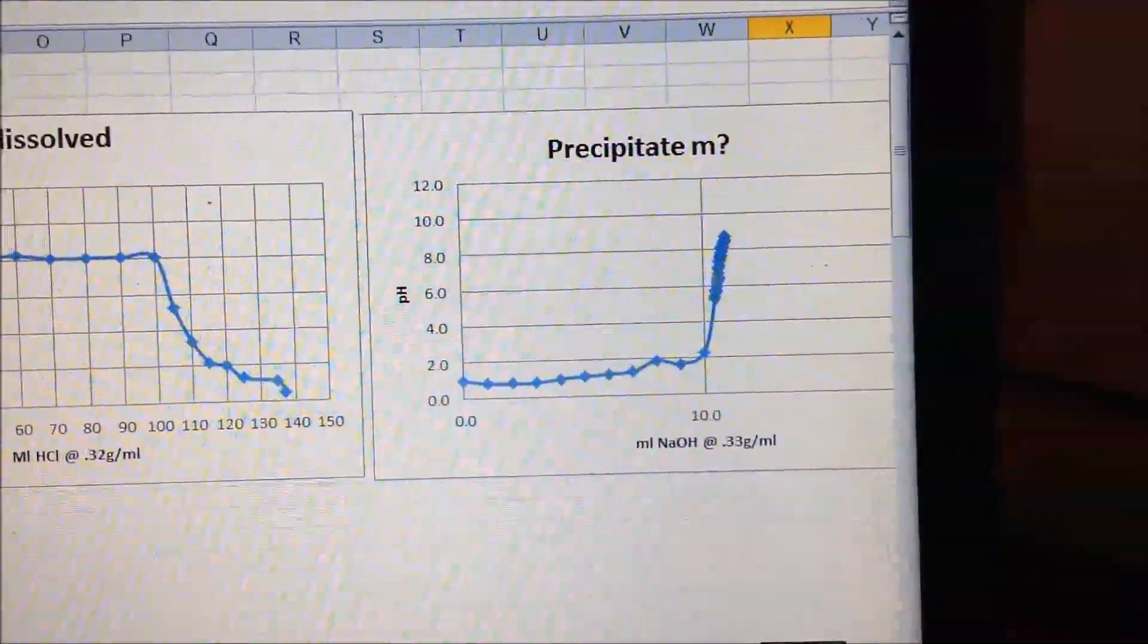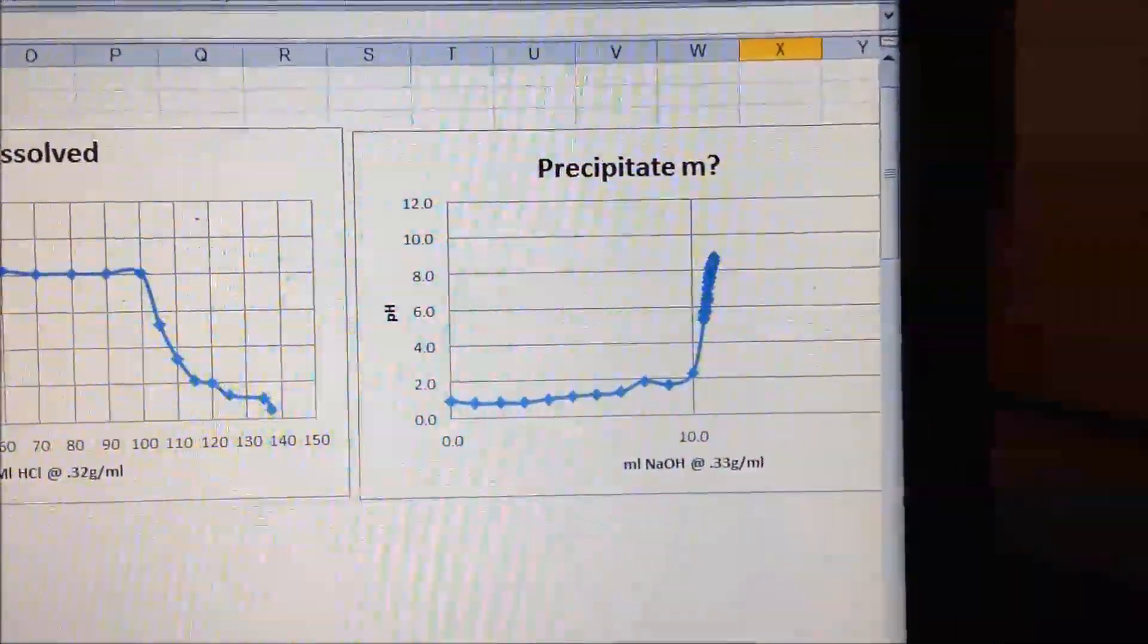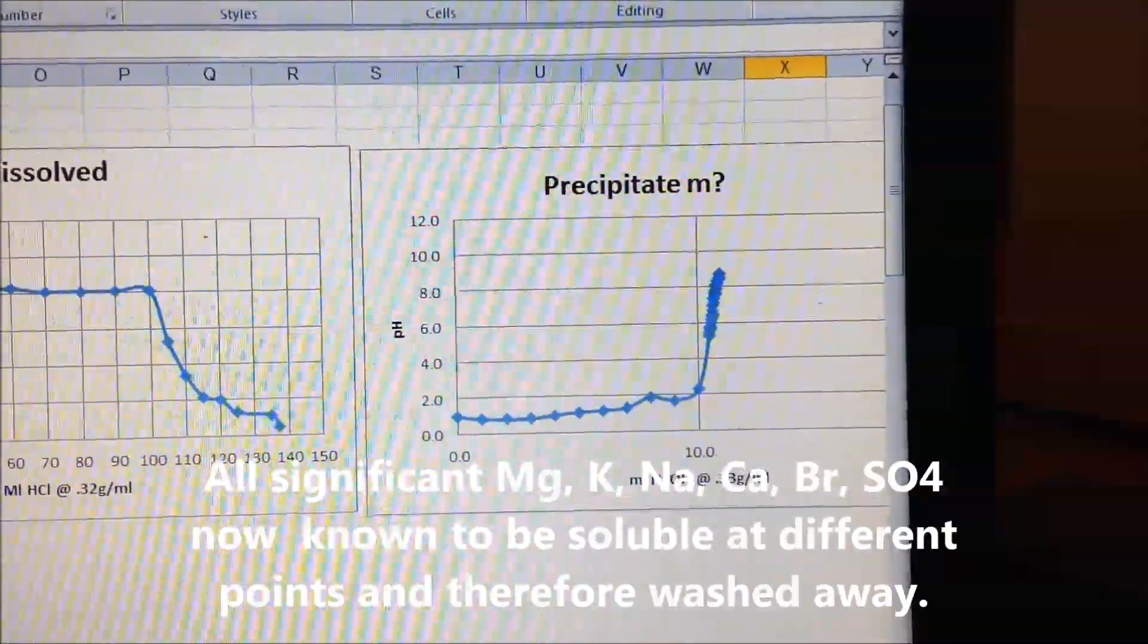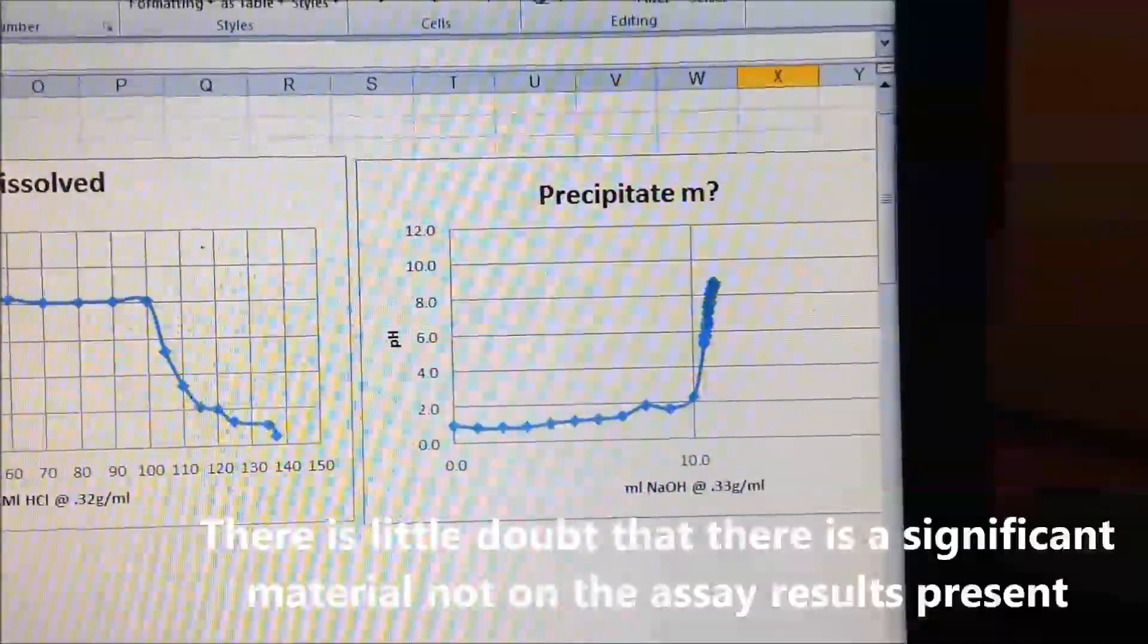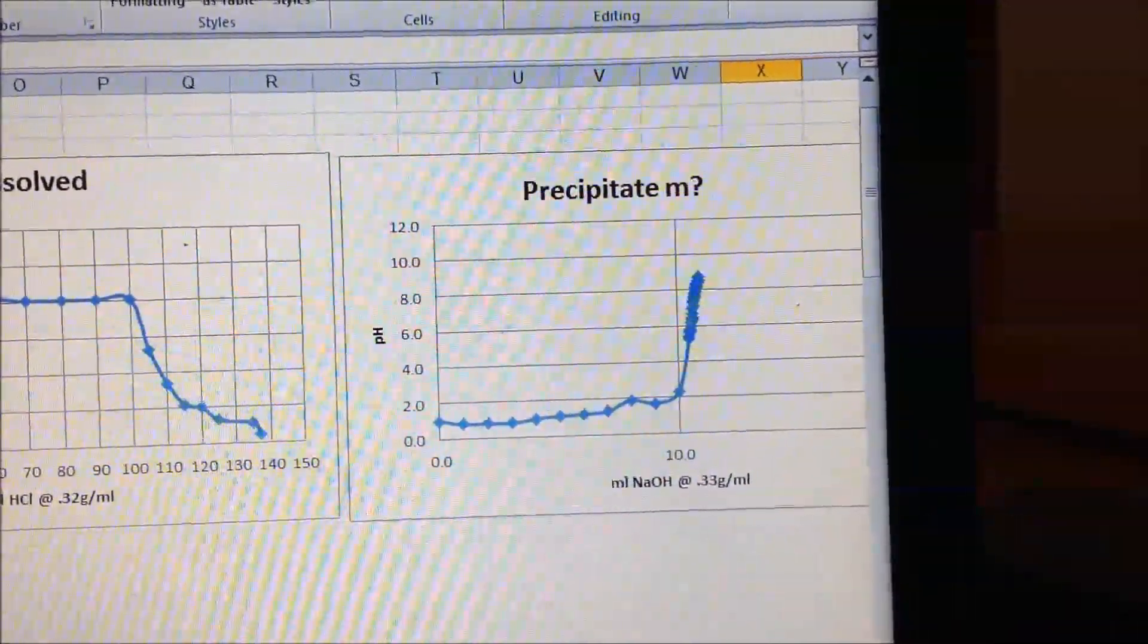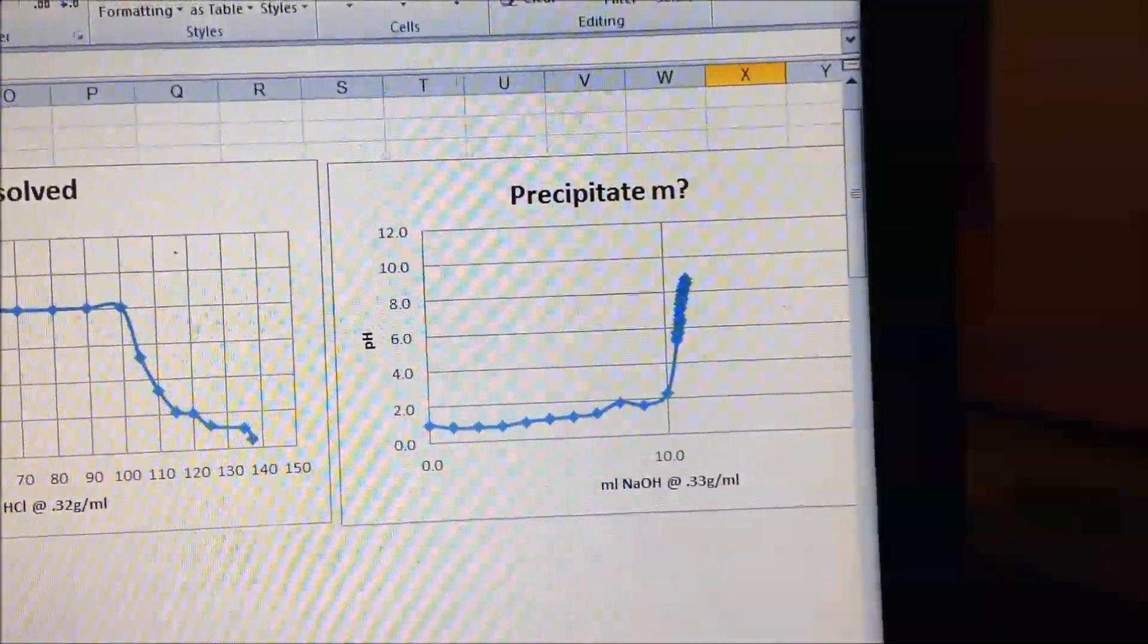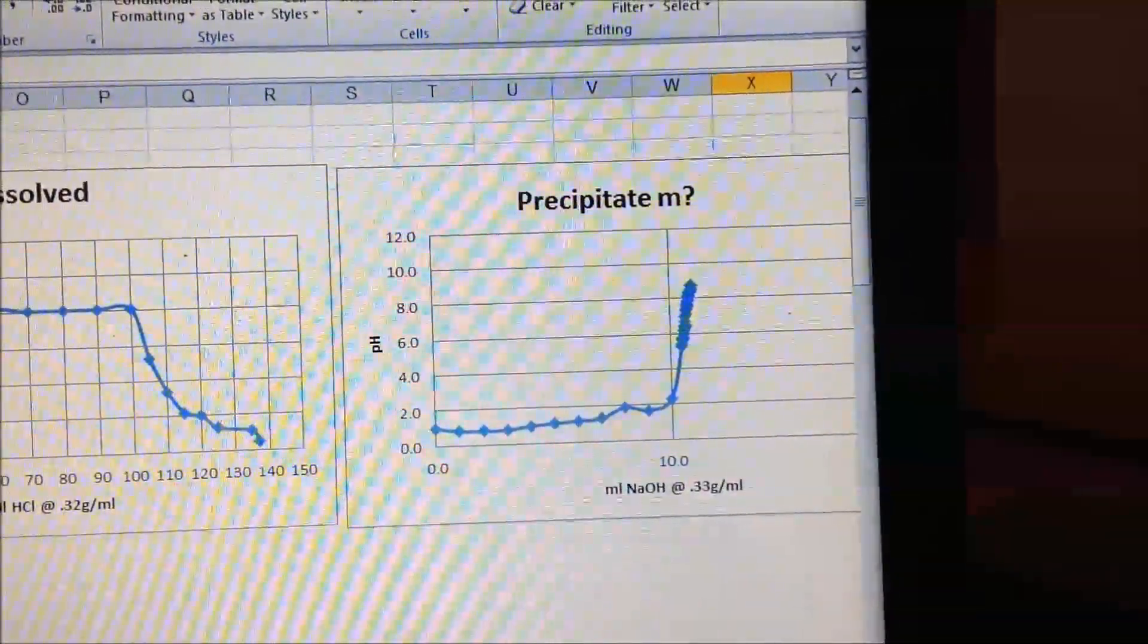Next, we have then re-precipitated. And you see the amount of precipitate we've got. It is possible there is some calcium in there, but it doesn't account for the full volume of it because it was only 0.2%. So that's not a huge amount. Like 1% of 150 grams would be 1.5 grams. So 0.1 would be 0.15 grams. So 0.3 grams is all that could account for that. So we do have something, whether it's the so-called M state, that's something for further investigation. But we have got something that's very interesting.